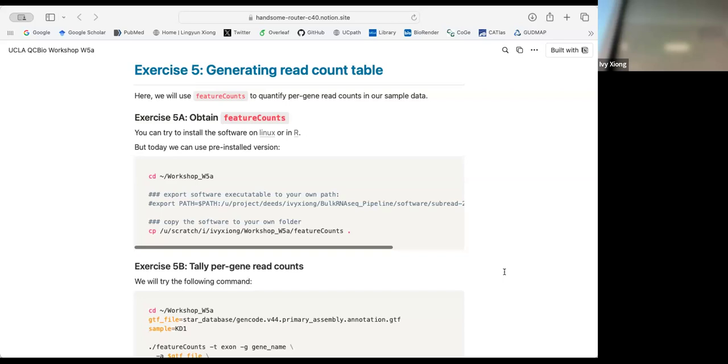You check, do you have STAR on? Was it not copied yet? Oh, it's the STAR database, sorry. So you don't need it, it's here already. We didn't do wrong.